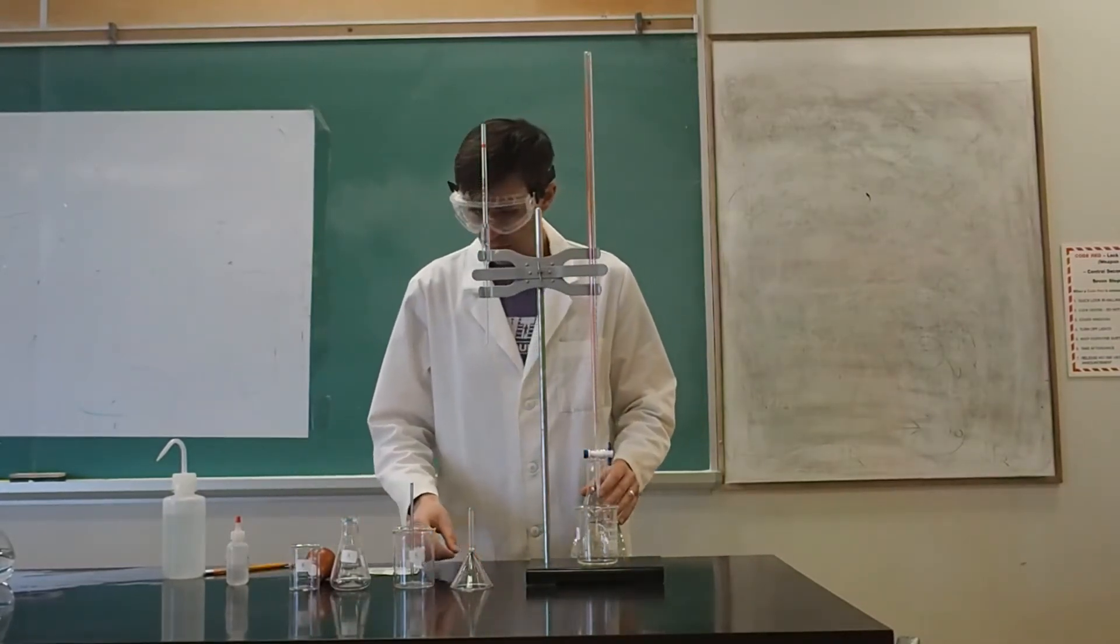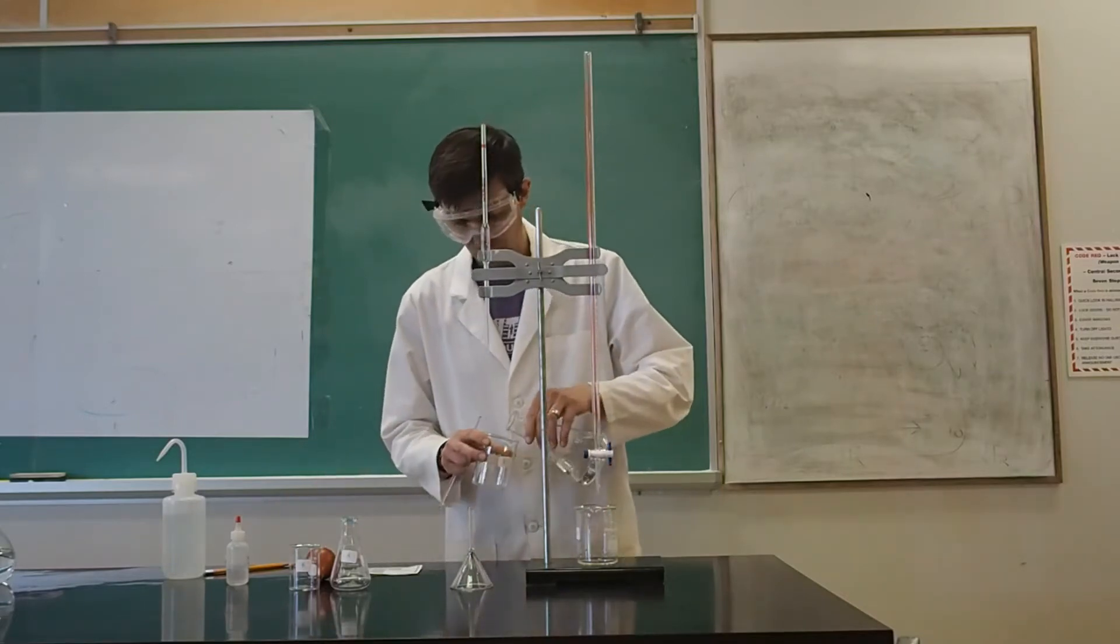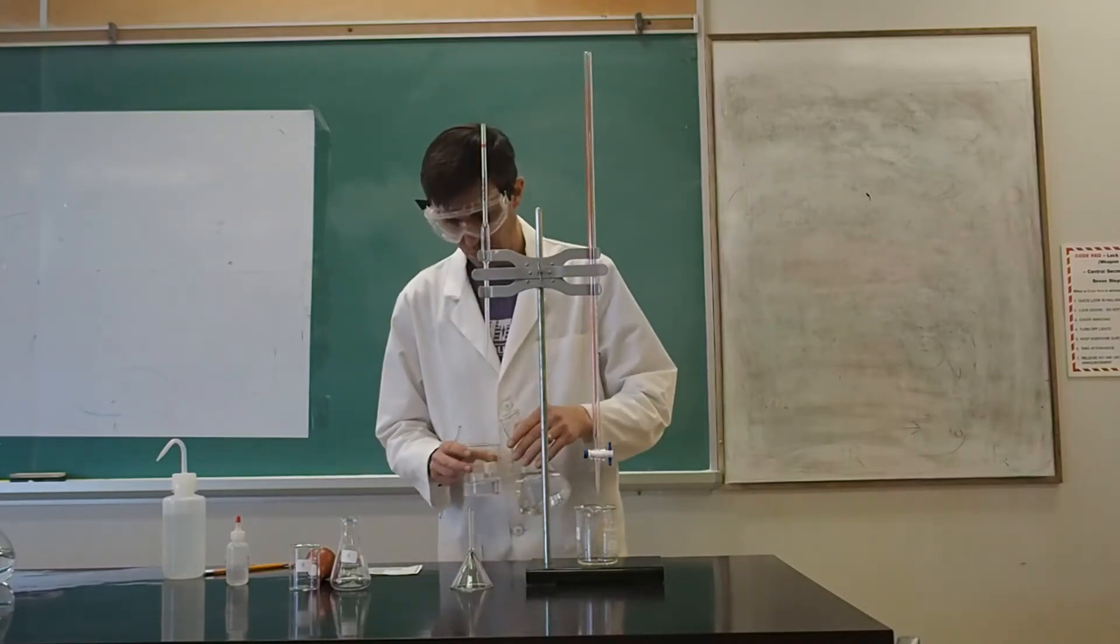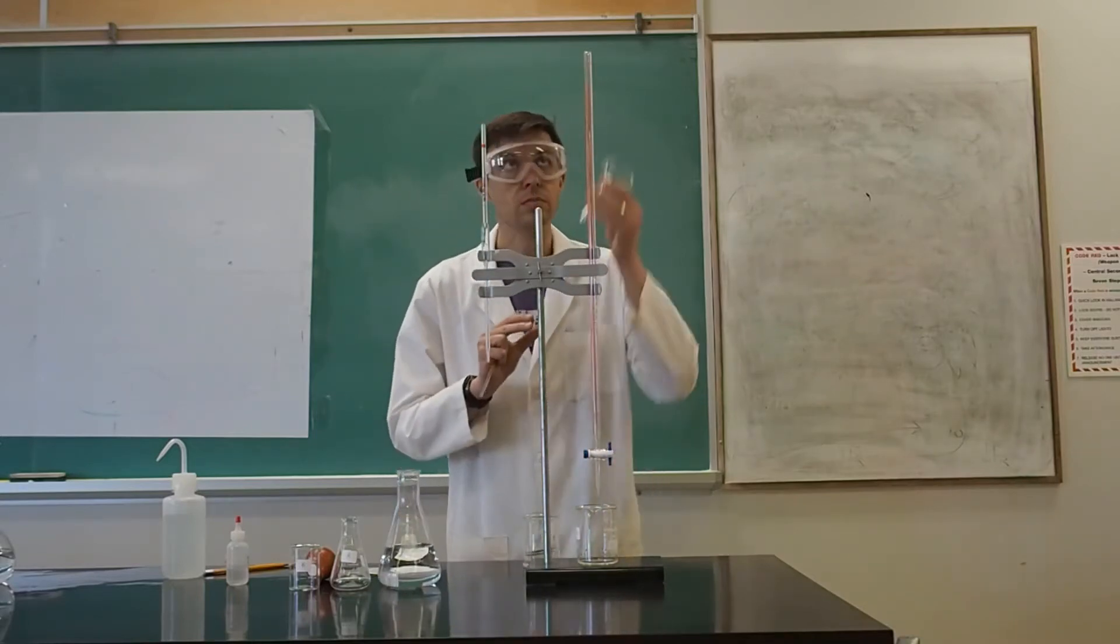The solution that we fill the burette with is referred to as the titrant. This is often, but not always, the solution of known concentration, which is called the standard.